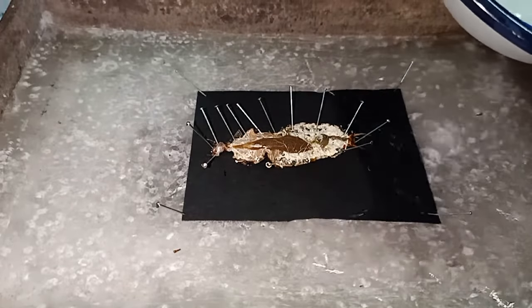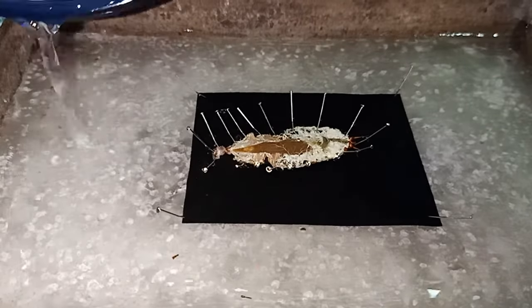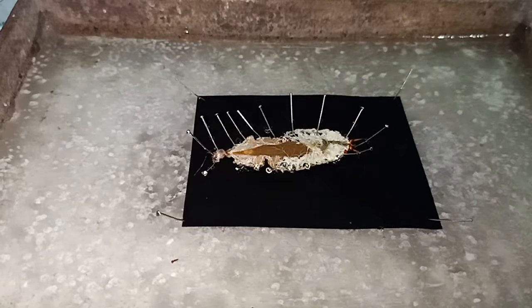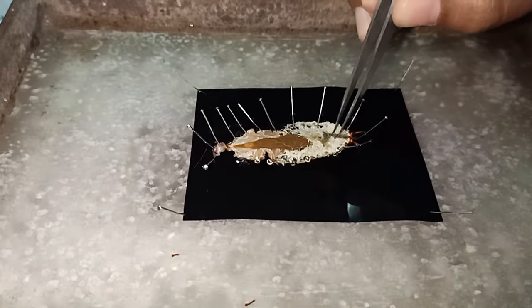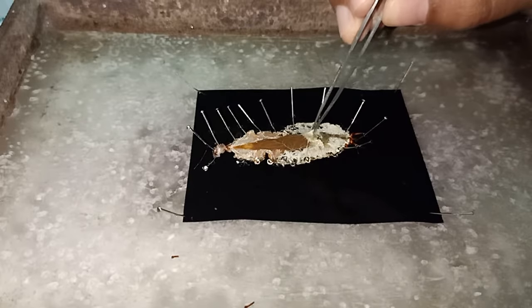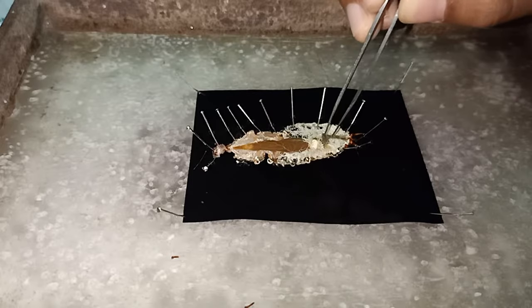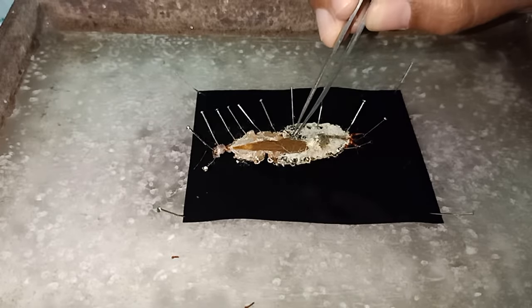Another important note is to pour water to prevent drying of the dissected specimen. The nervous system is present behind the digestive system. To expose the nervous system, the digestive system must be removed completely.